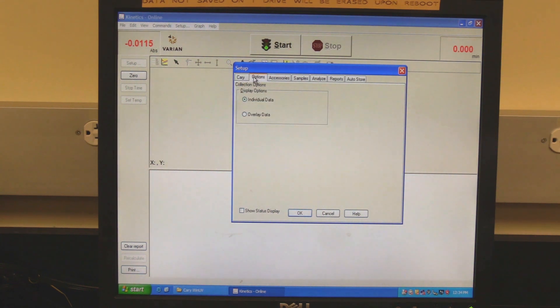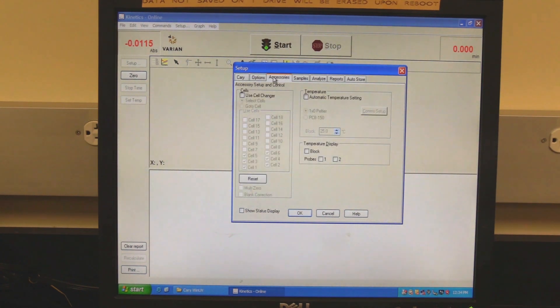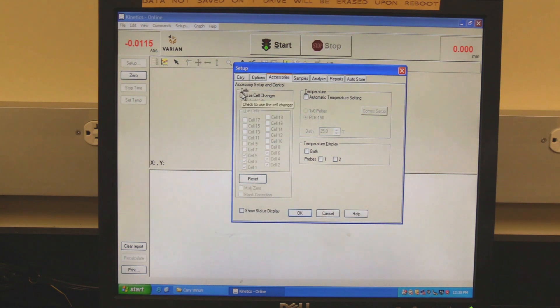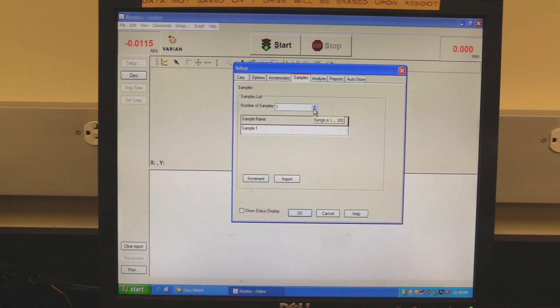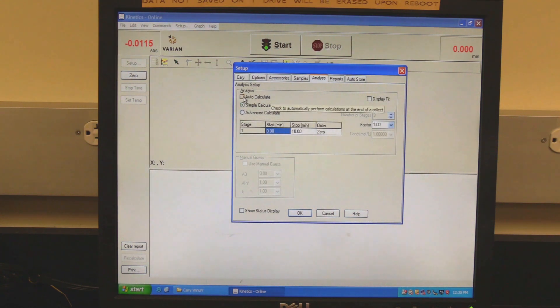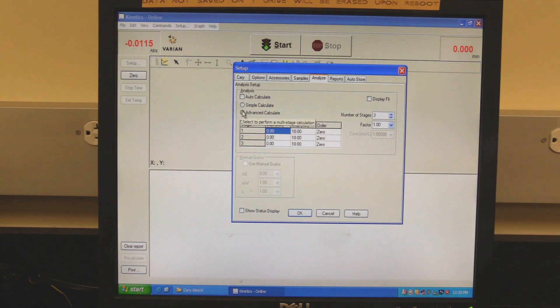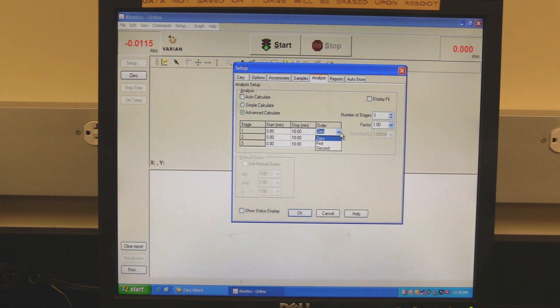Click on the Options tab and set whether to display data individually or overlay. Click on the Accessories tab. To use the cell changer, check the Use Cell Changer box and check the boxes for the desired cells. Click on the Samples tab to set the desired number of samples — use the up arrow to increase and the down arrow to decrease. Click on the Analyze tab. Check the Auto Calculate box so the software will automatically calculate at the end of the measurement. Select simple or advanced calculate. Set the order to zero, first, or second, and set the required factor.